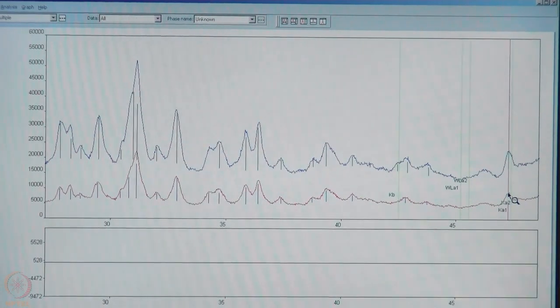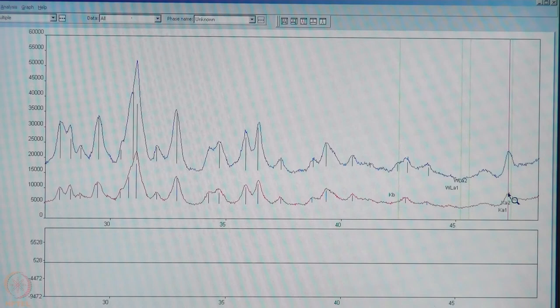which was not there in the red in the original. So, this shows that the presence of K beta becomes more and more significant for all kinds of peaks, small angle to high angle, very weak reflections to strong reflections, and hence it will create problems in data indexing.